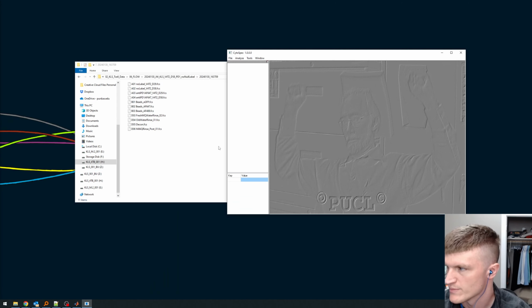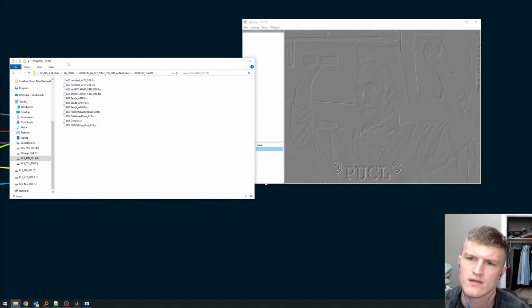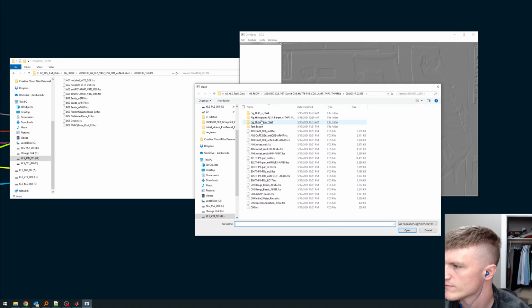From there, open up the program. Very old school, looks like this. I'm currently using a Windows PC. I've tested this on Windows 10 and 11. It works great for those. Let's go ahead and open up our files.